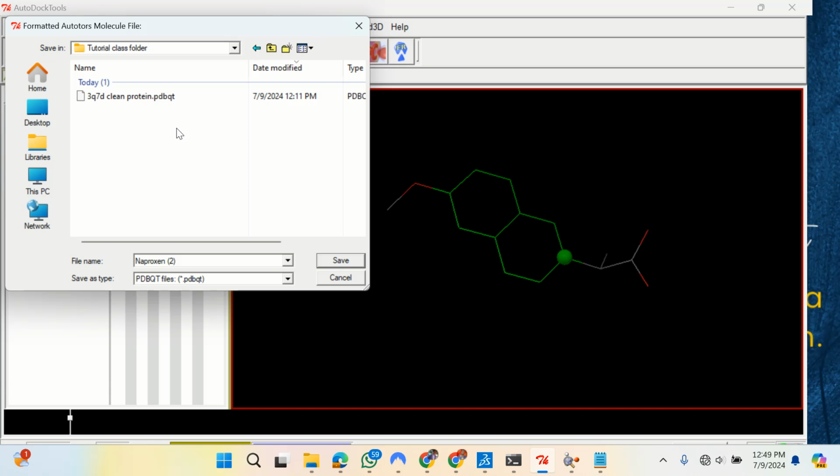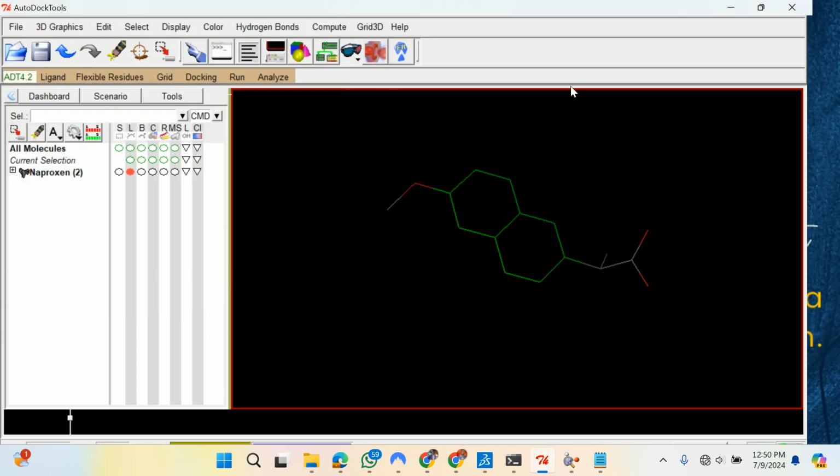If you clean it, you must write exactly that name. Is that okay? So that is it. So you just have to be a bit careful with that. So this is what I have. I cannot save. Is that alright? So I'll save this. And then I'm done with this.